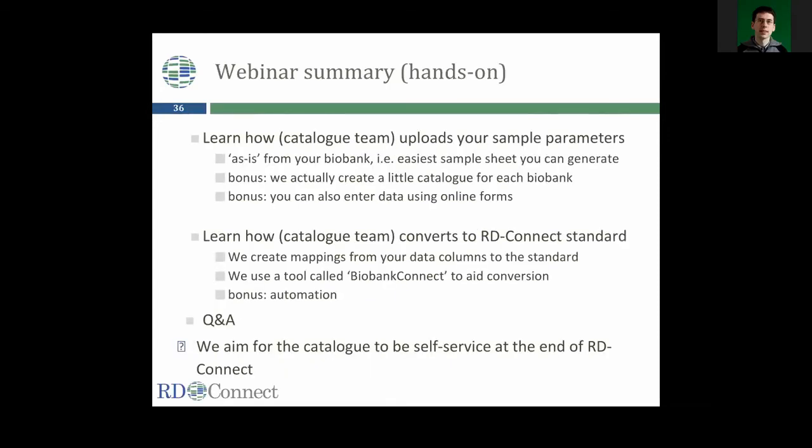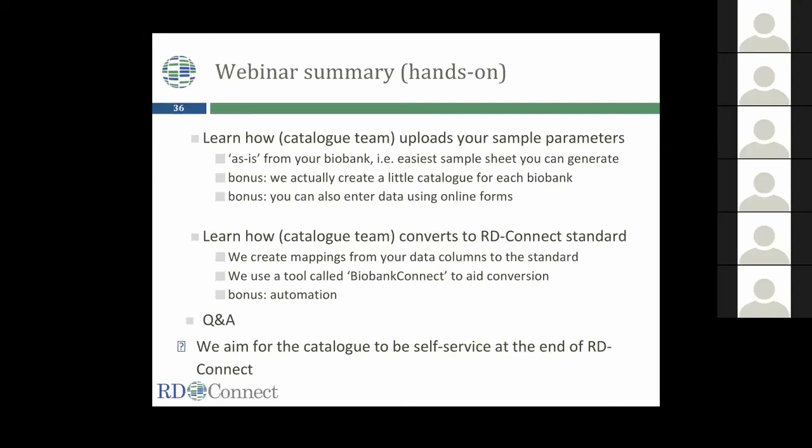So it's a very brief summary of how we do this upload. From each of the biobanks, we will generate an upload of your data as is, and then we convert it to the RD Connect standard data model by creating a mapping of your data to convert it.